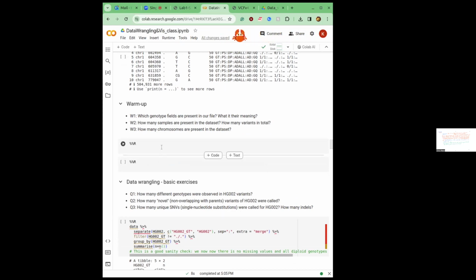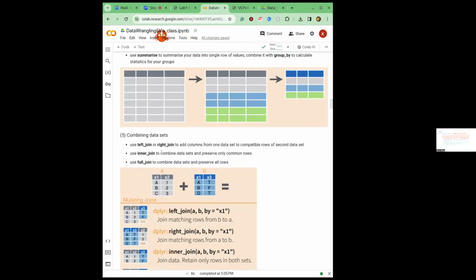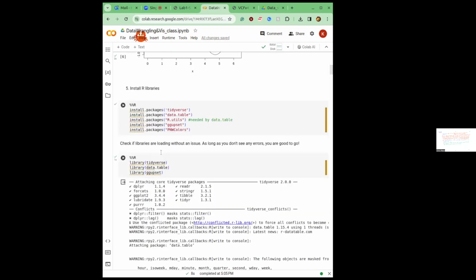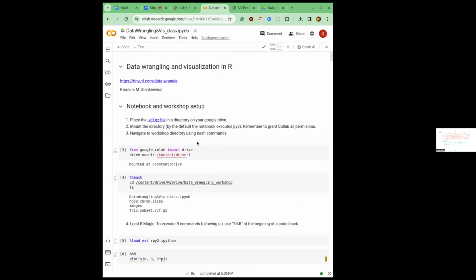No? I couldn't load the file. You cannot load the file? Yeah, first of all, I can't set the working directory. That was the main problem. Do you have the same problem? No. And no such file or directory. Oh yeah, that's the problem. I can set the working directory, and then the file does not exist or it's non-readable.